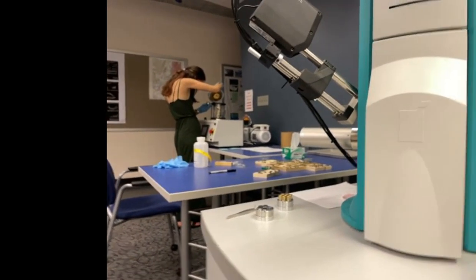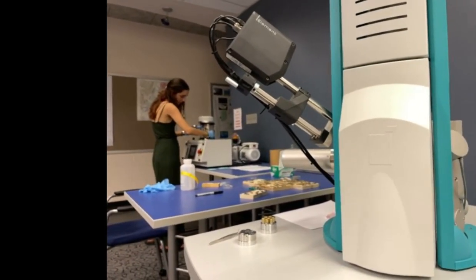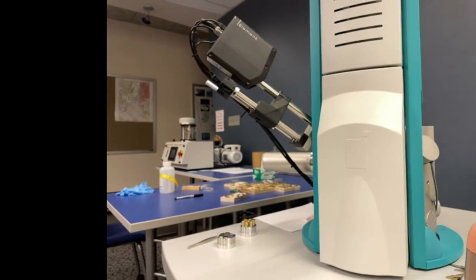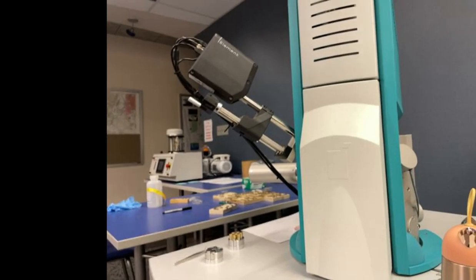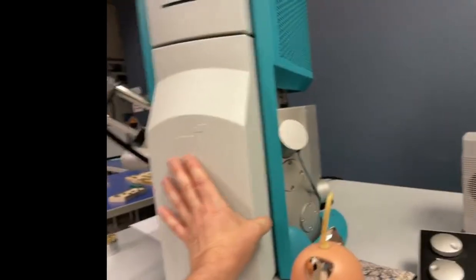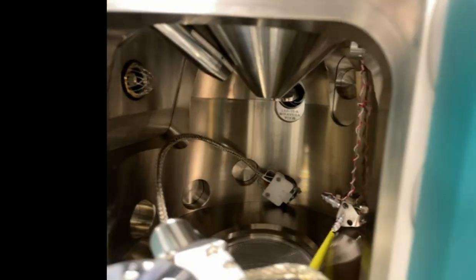And then we're gonna just open up the chamber here, pop them in, and then we've got to pump down the SEM as well. But from there, then we'll be actually using the SEM. And I can switch over to the other camera so you don't have to put up with non-gimbaled hand cam movements. So you can pull this open, and I can give you a sense of the chamber itself. That's what it looks like on the inside.